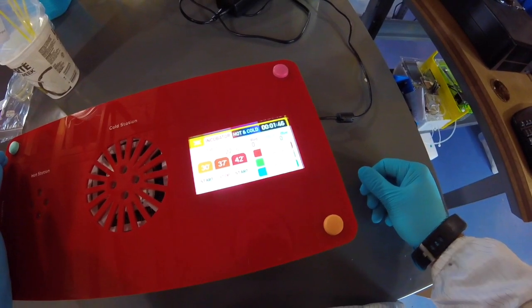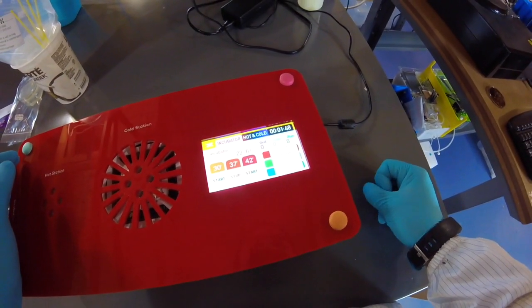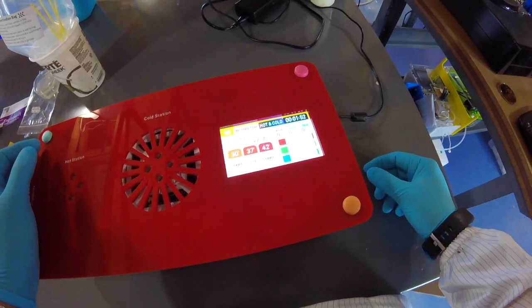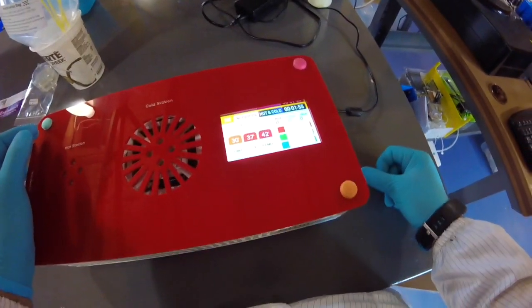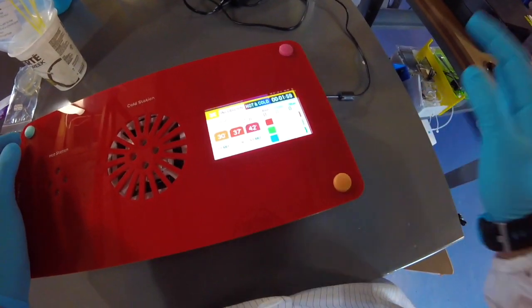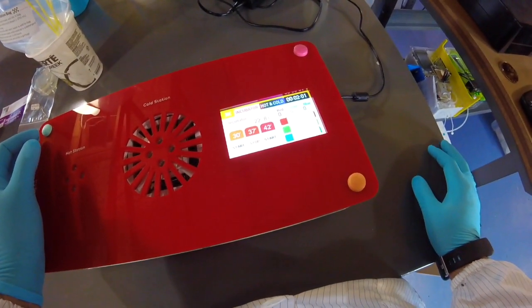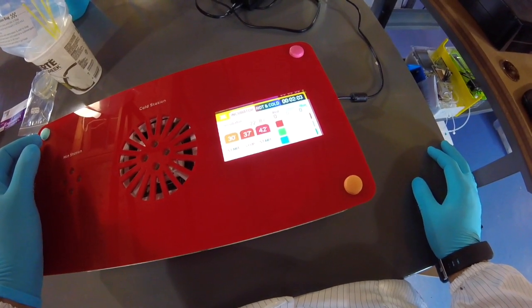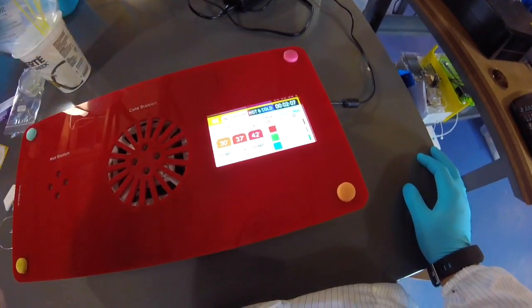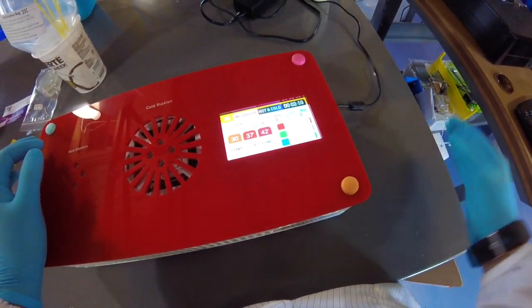We're going to let these incubate for up to 24 hours, and it's really important that you don't wait any longer than that because once you hit that point, the cells just don't take in DNA as well. All right, the ideal time is around 12 hours. Once you see these small colonies growing, 16 hours is still great, and 24 hours is the latest, all right?